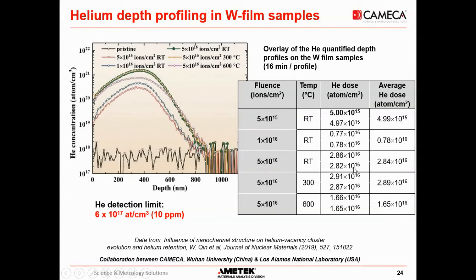And it has also shown that for the higher dose value, the real dose implanted in the sample was smaller than this value. And also when using annealing, particularly with high temperature, SIMS could also show that there was a loss of helium inside the sample.